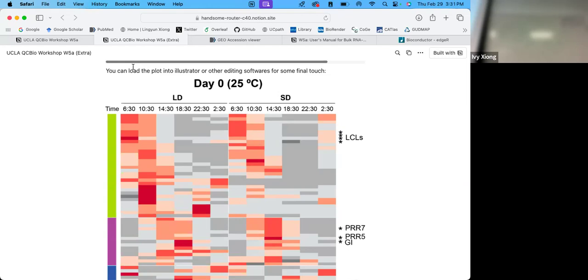And it makes that in one go. Quite magical. Right, so I'm just thinking, I'm plotting too many. I'm going to make a script that churns out the figure I want. That's good to know.